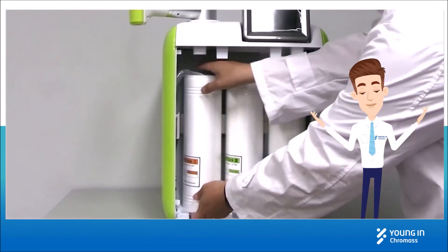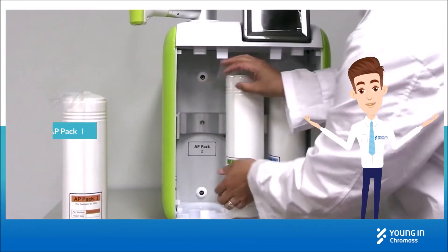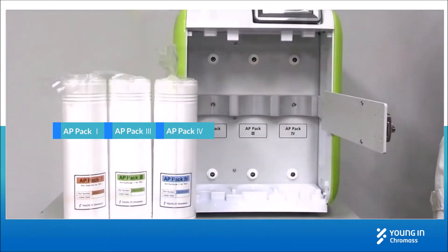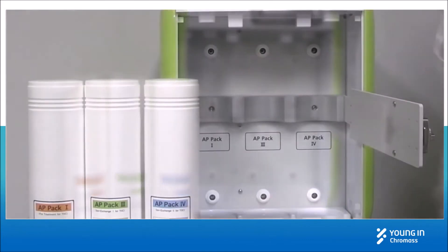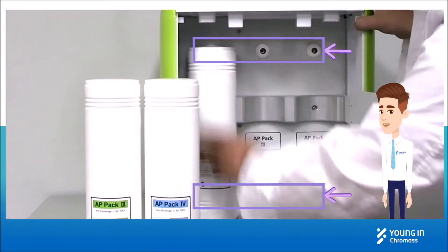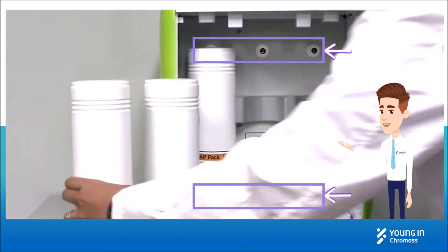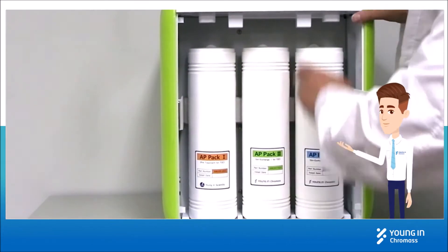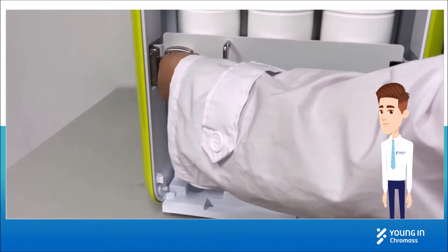There are three filters included, which are AP Pack 1, AP Pack 3, and AP Pack 4. Take off the plastic covers, and you only need to put these back by inserting them into two holes each. Close the filter bar and lock it.